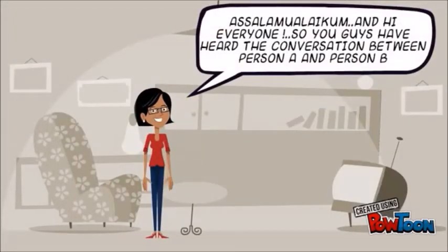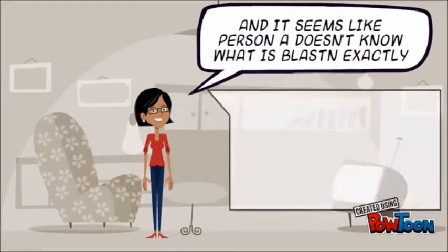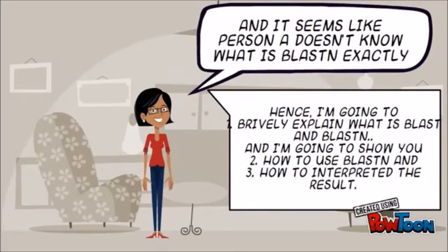Assalamu'alaikum and hi everyone! So you guys have heard the conversation between person A and person B and it seems like person A does not know what is BLAST N exactly. Henceforth, I'm going to briefly explain what is BLAST and BLAST N and I'm going to show you how to use BLAST N and how to interpret its result.